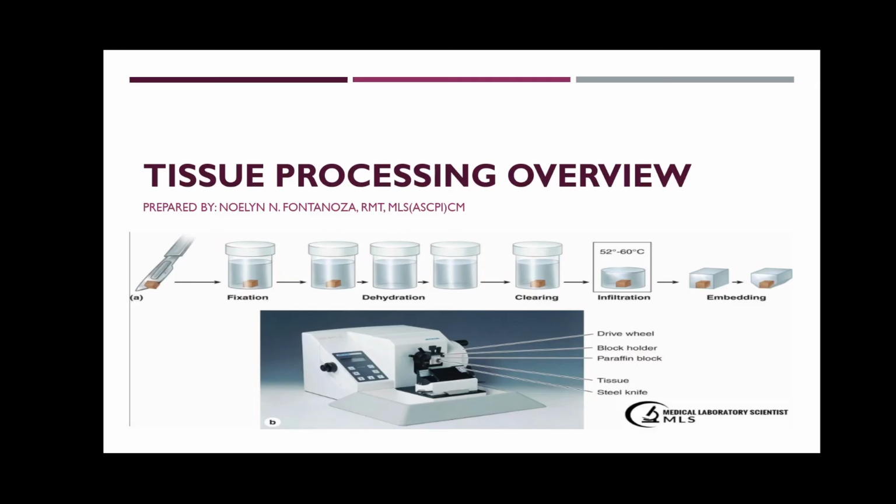Histo, patho, and logi or logos. When you say cytology, the study of cells, and what are the techniques used in order for you to assess the pathologic processes that is happening in the cells and in the tissue.